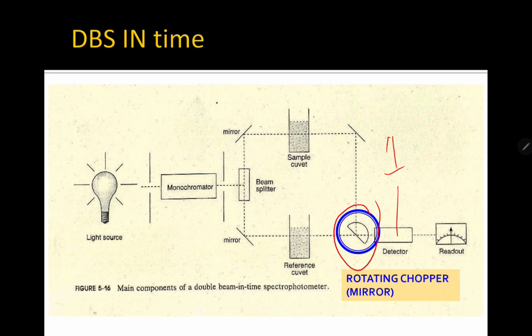So to better remember this one, remember space has two syllables, no? S space. So wala lang, S space. So 2 times yung binanggit, so dalawa ang kanyang detector. While time only has one, so therefore one detector para mas madali siya. Okay? So ano siya guys, no?